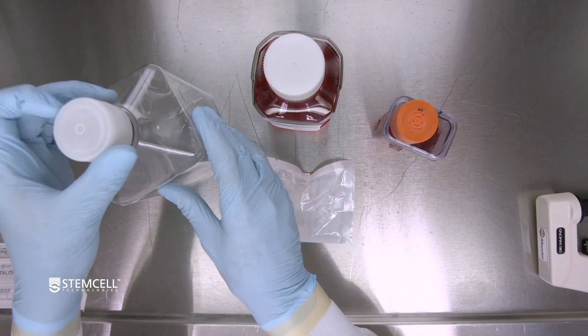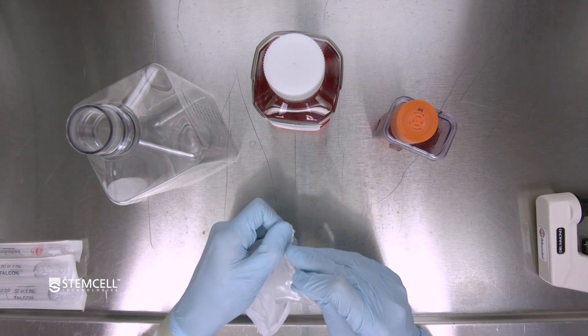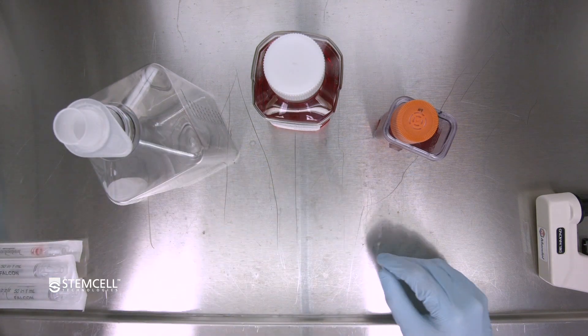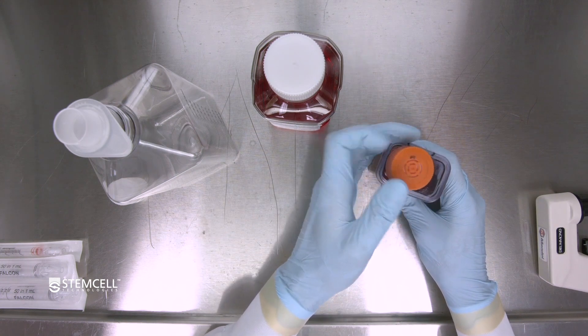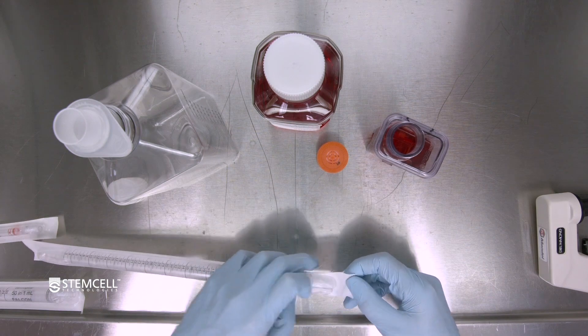Remove the filter from the package and place it on top of the waste bottle. This will capture any aggregates in the spent media. Remove the cap of the PBS bioreactor vessel and place the cap face down.